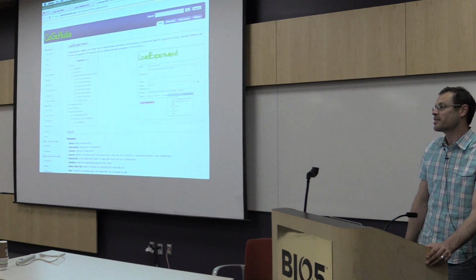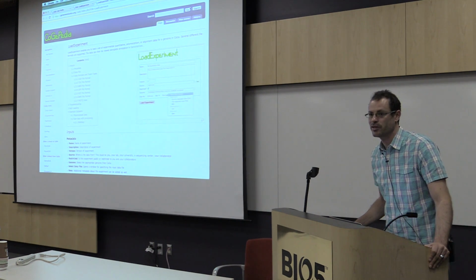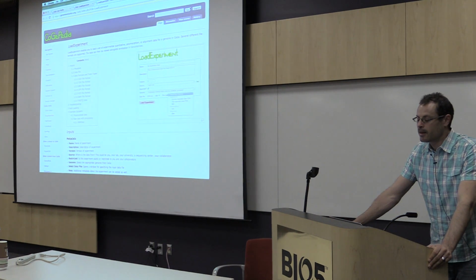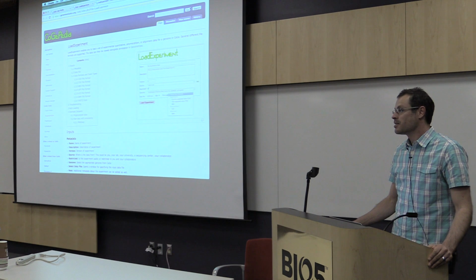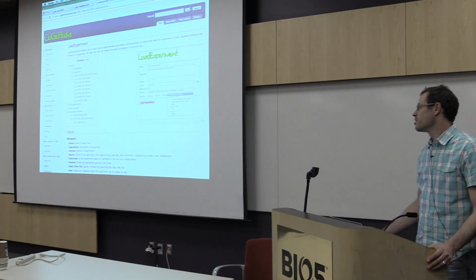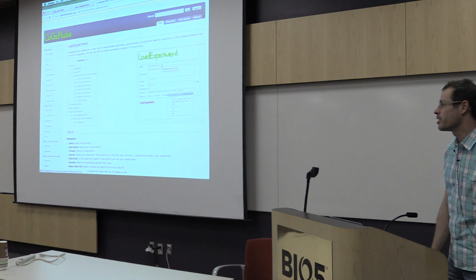And what page docs is going to do is take you to our internal wiki system that we use for writing tutorials, documenting the system, putting in some neat analyses that we see. And it basically walks you through all the information that you need about how to load experimental data into CoGe.